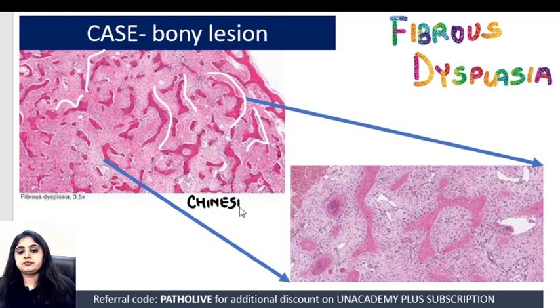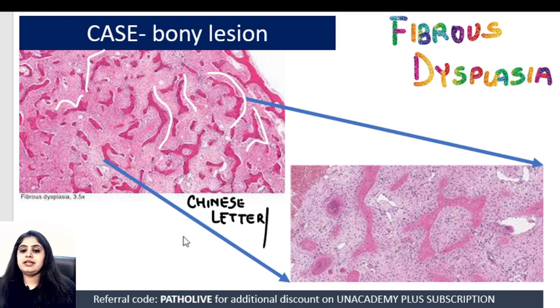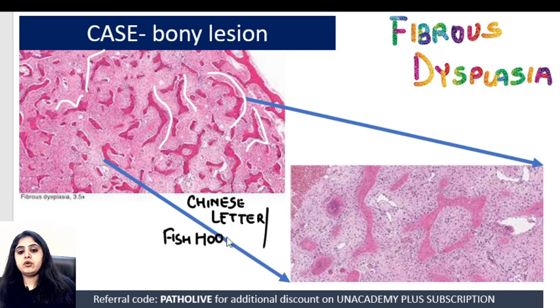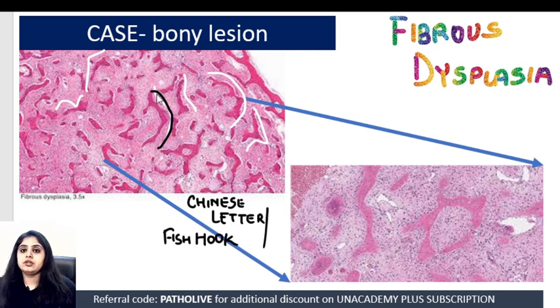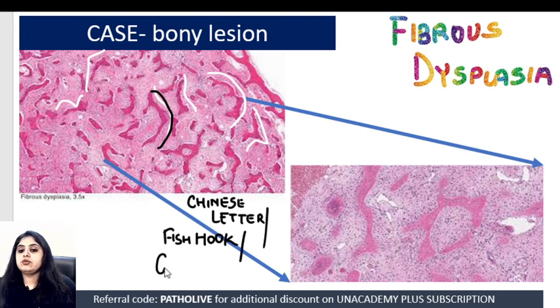When talking about Chinese letter pattern, it has been given many names. Some people like to call it the fish hook type of bony trabeculae, because it looks like the fish hook used for catching fish. Some people also call it other names based on imagination.